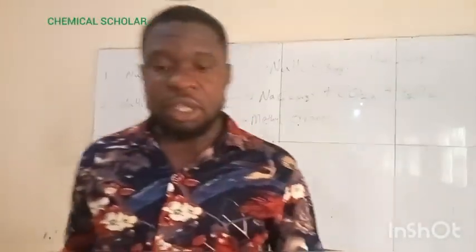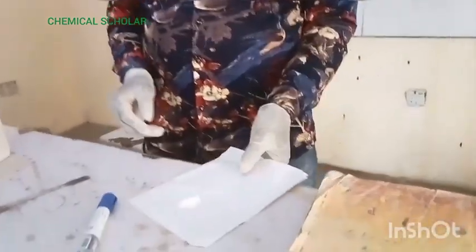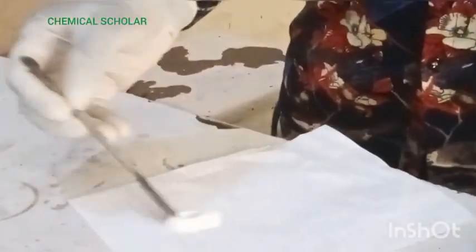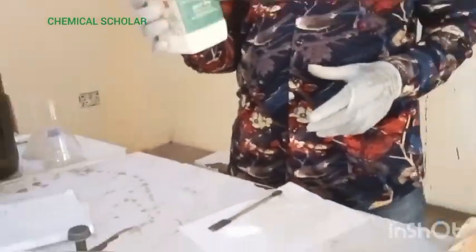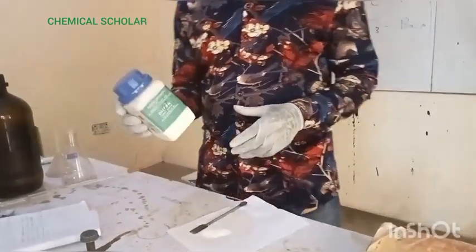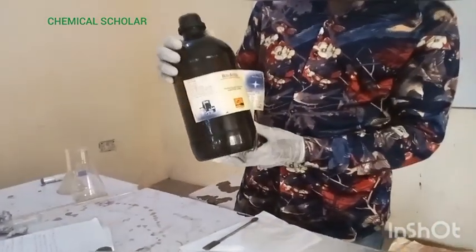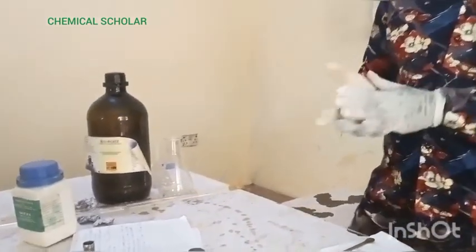Okay, so here I have some of the specimens that are needed. You can see this is sodium carbonate — you can see it is white in color. This is sodium carbonate, and from this we are going to prepare the base solution — the alkaline solution. Then this is hydrogen chloride, our hydrochloric acid, and this is what we are going to use to prepare the acidic solution.